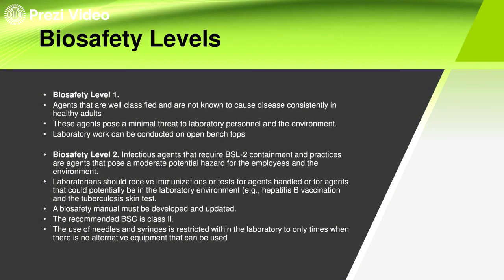So, ano ba yung mga different biosafety level na yan? So, kapag level 1 naman, again, sabi ko nga kanina, these agents pose a minimal threat to lab personnel. So, pwede mo siyang gawin sa open bench top. So, yung mga process na ginagawa kapag biosafety level 1, pwede kang mag-work dun lang sa table. So, ang meron tayo sa school is biosafety level 1. Pero meron din tayong kasing biosafety cabinet. Kaya pwede rin tayo mag-handle ng biosafety level 2 microorganism.